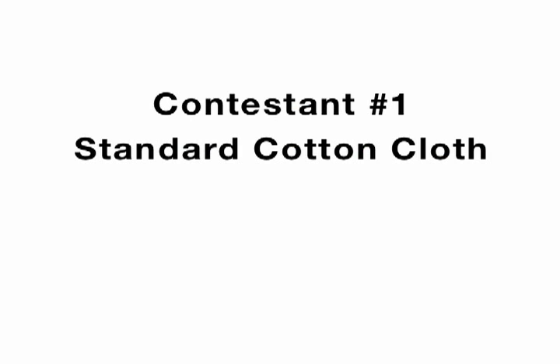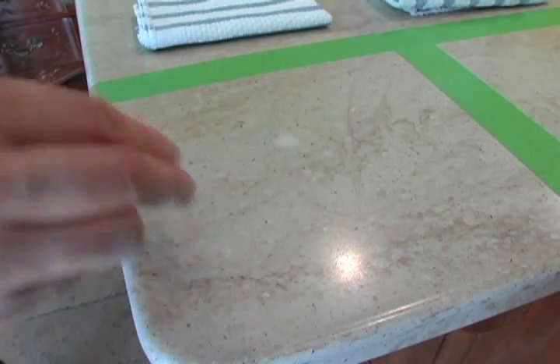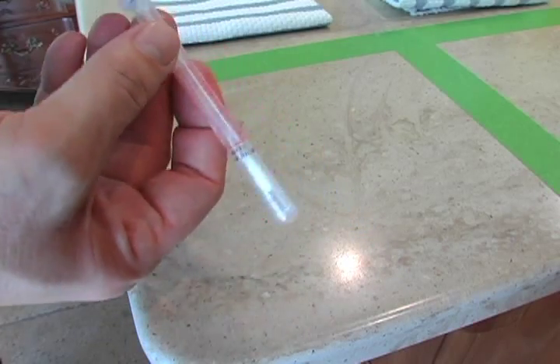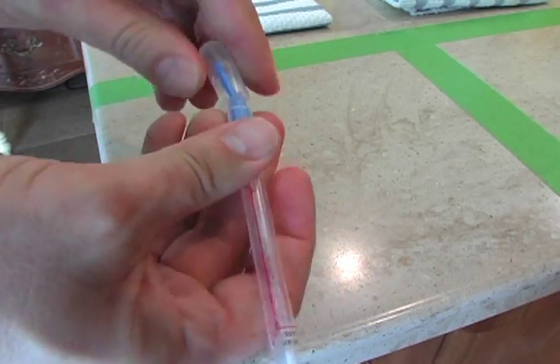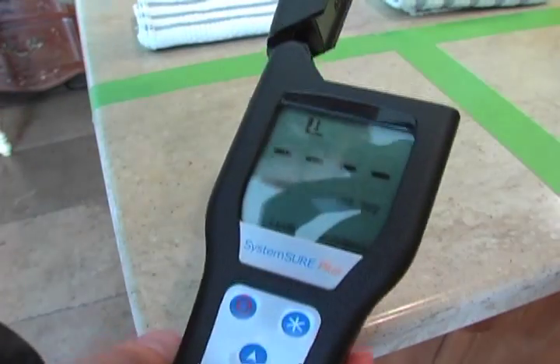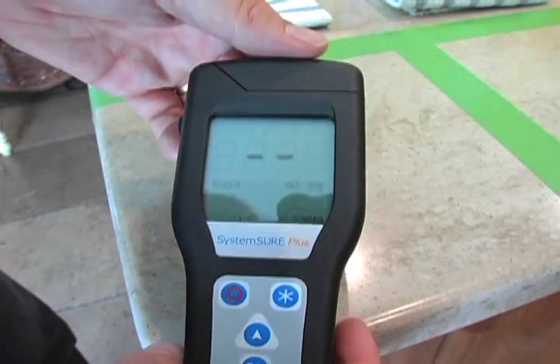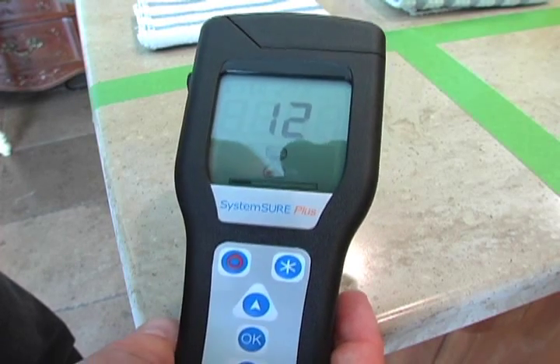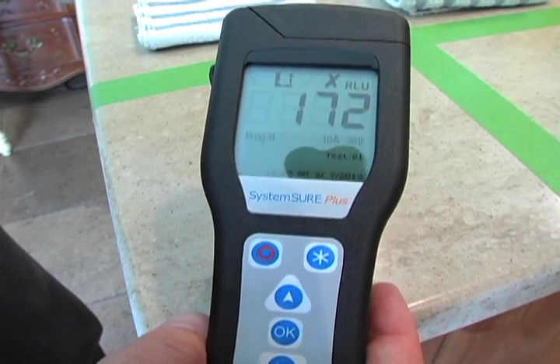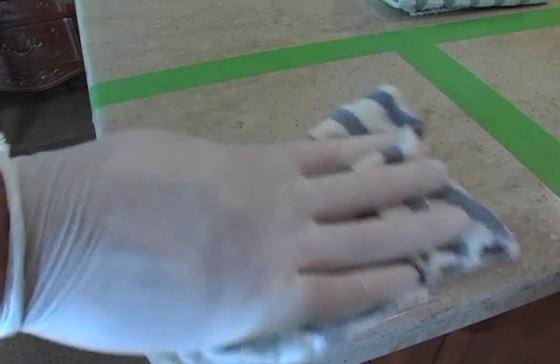Our first contestant is a standard cotton cloth. We first create the biofilm and then take a standard swab, swab the area thoroughly, and place it back into the tube. Then we break the tip that contains the testing solution and squeeze it down into the bottom where the swab is, shake it up, place it into the ATP tester, press OK, and wait about 15 seconds. We get a reading of 172, which means the area is very contaminated. Then I wipe the area thoroughly with a damp cotton cloth.